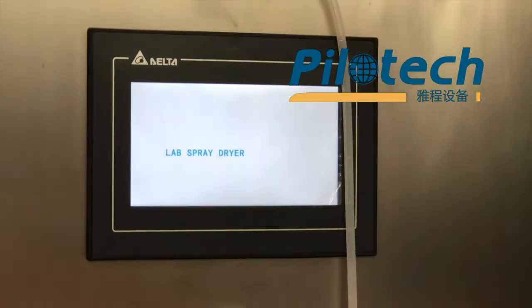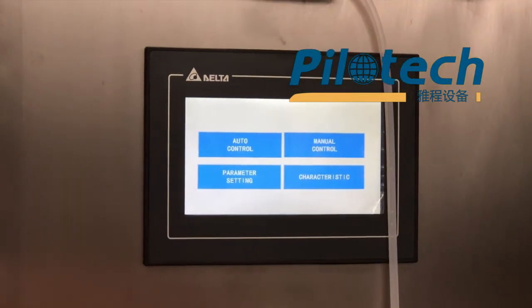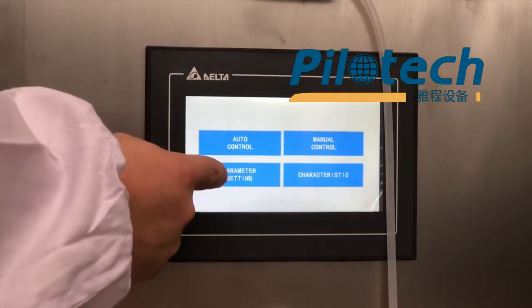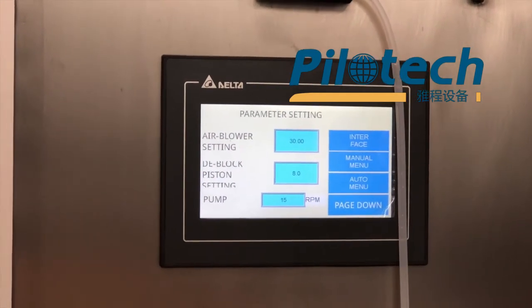Choose English. Click Parameter Setting. You can set the parameters you need here.